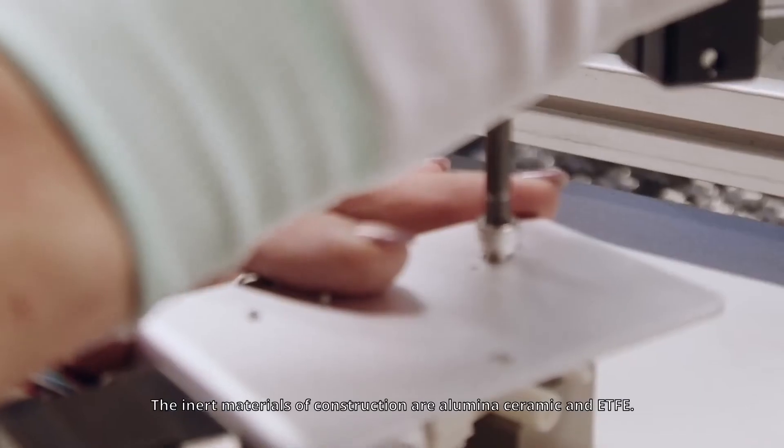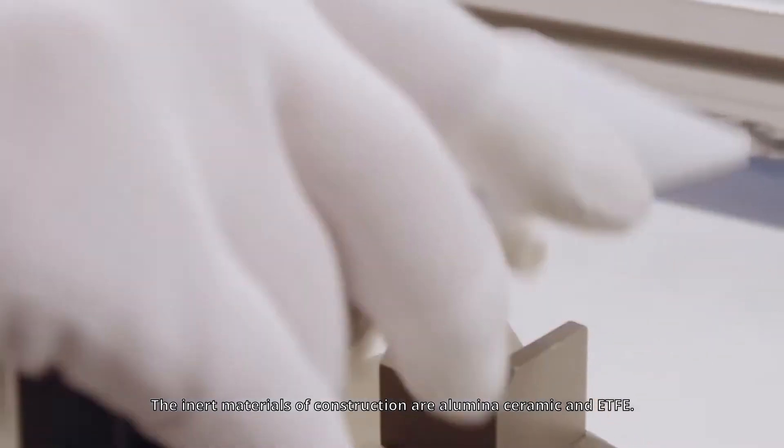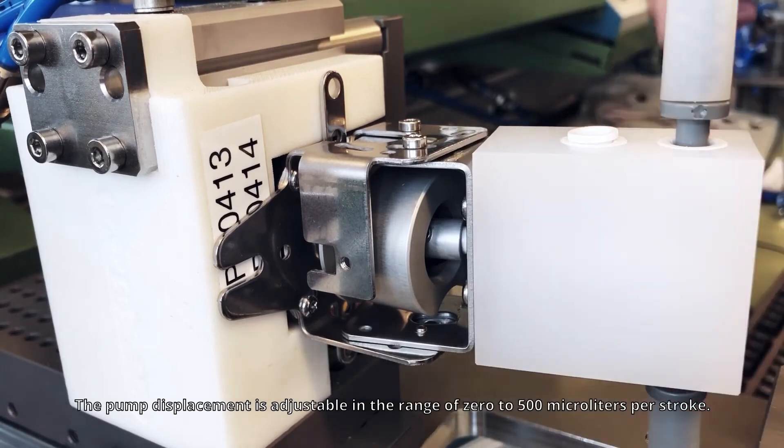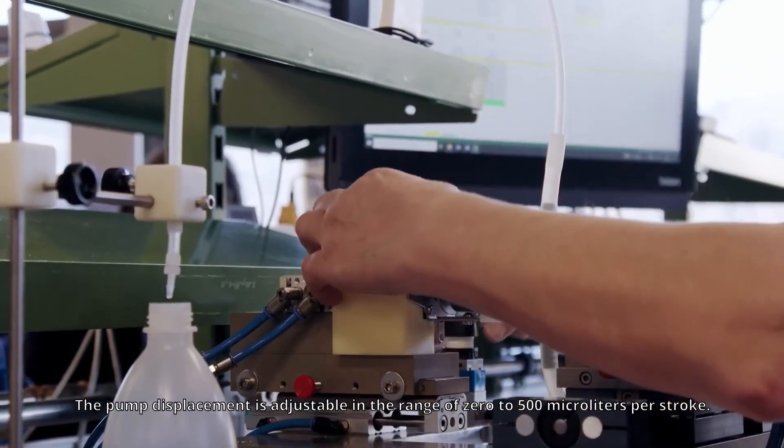The inert materials of construction are alumina ceramic and ETFE. The pump displacement is adjustable in the range of 0 to 500 microliters per stroke.